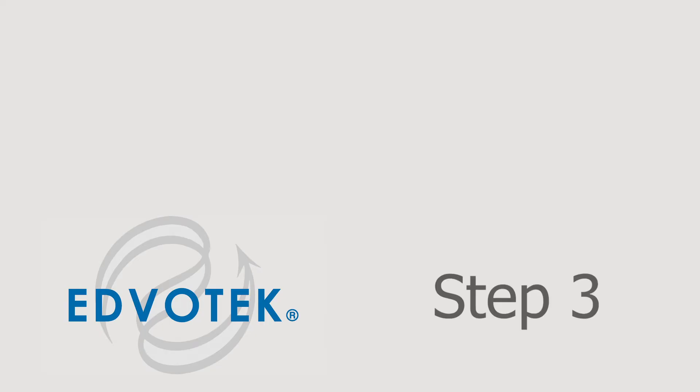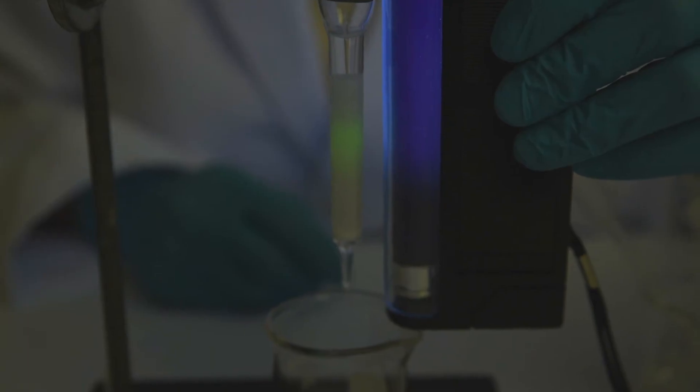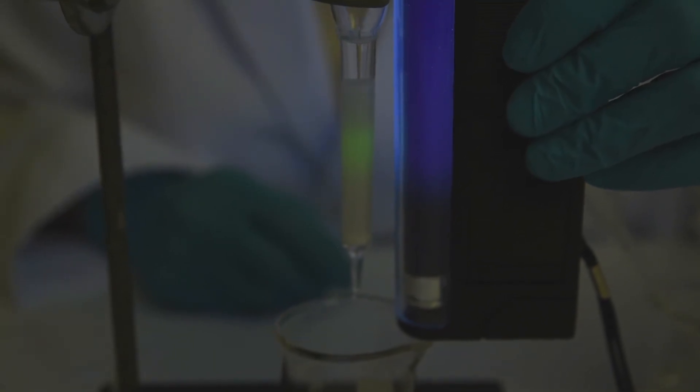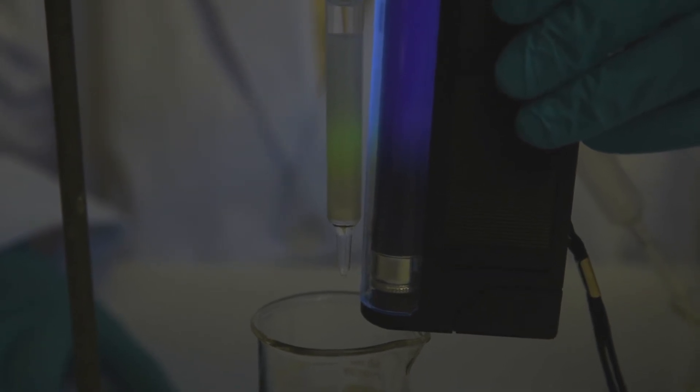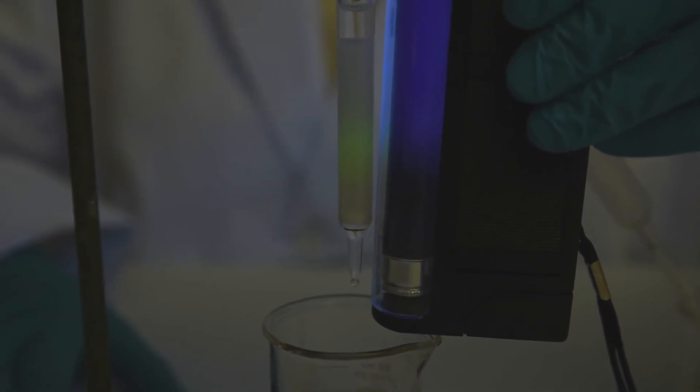Step 3: Monitor the progress of the GFP in the gel matrix by occasionally illuminating the column with the long-wave UV light source. Allow the elution buffer to drain into the waste beaker.